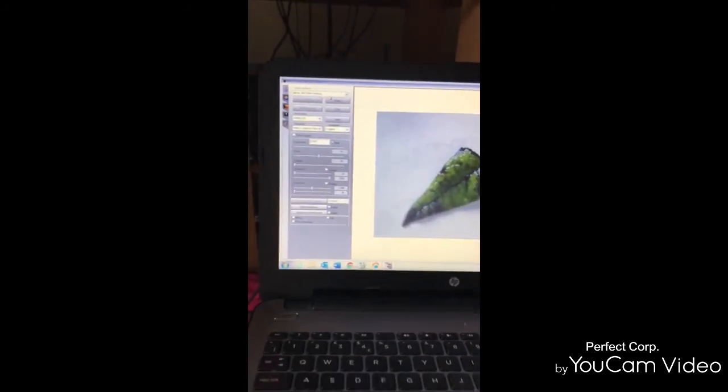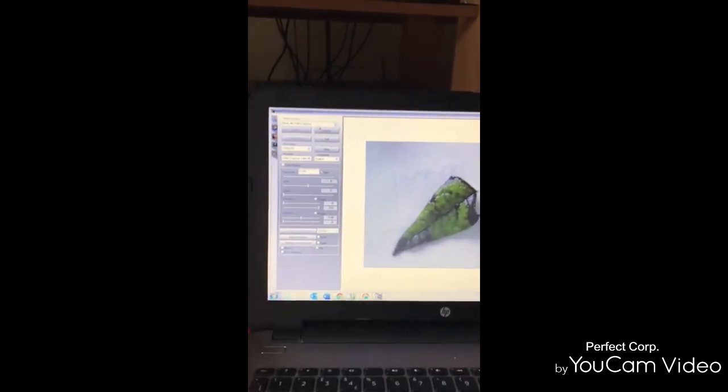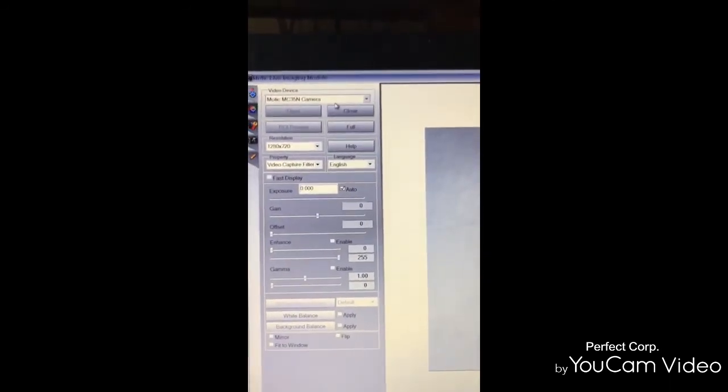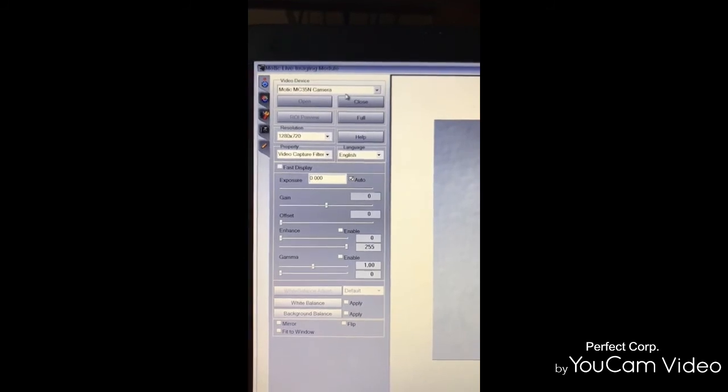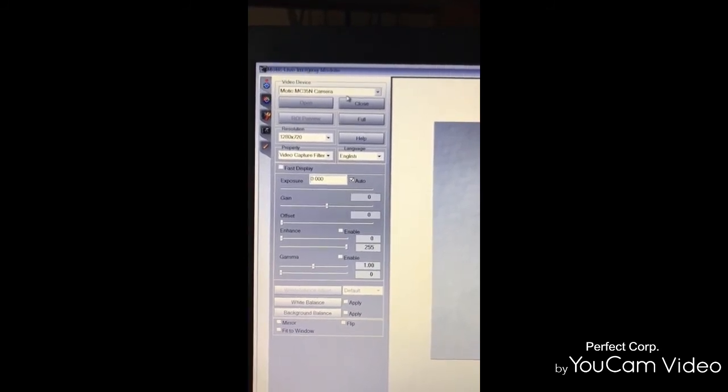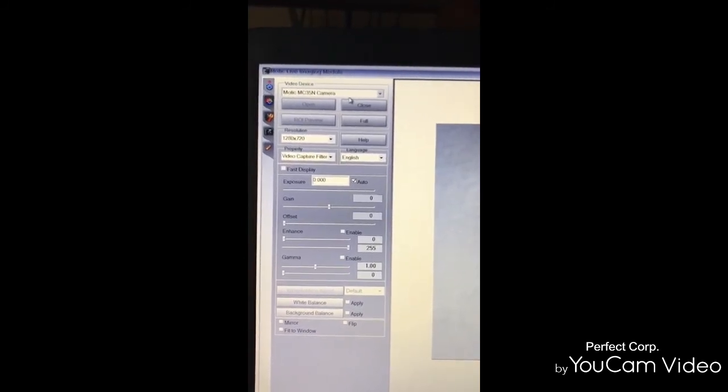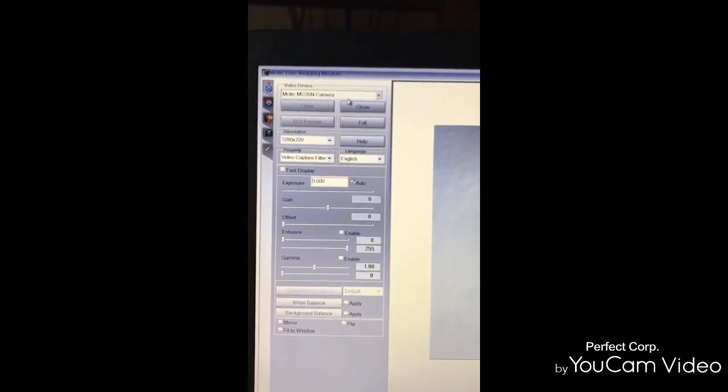With the software, of course, you can take pictures and then do measurements, save them, send them.